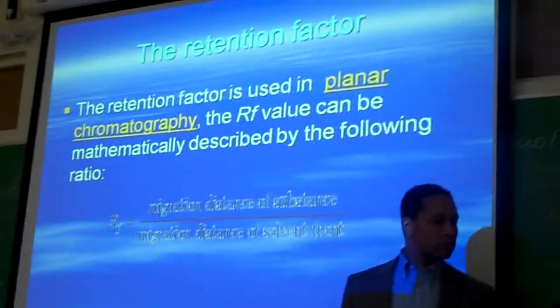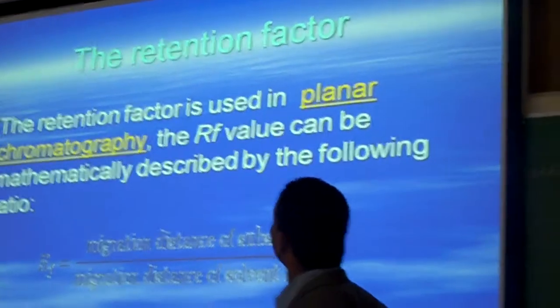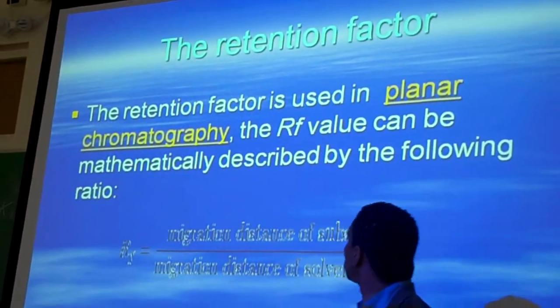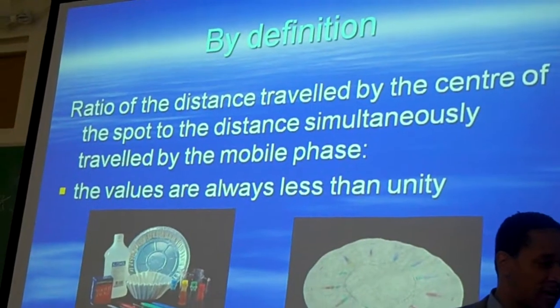The retention factor, this is something you need to walk away with today. It's described by the following ratio. The migration of the substance and the solvent front, which is what you'll be measuring today.